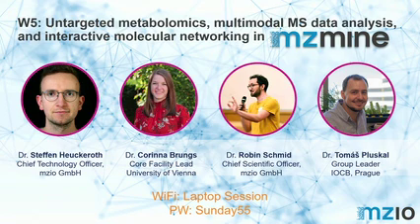So the workshop today will be basically on untargeted metabolomics and data processing in mzmine. We will have a short introduction to what mzmine is about, and then we will go into a hands-on session. The workshop here will be held by me, Robin, and Corinna. My name is Steffen. Robin is the one doing the pantomime here in the front. And Corinna, in the end, will also give you an introduction to library building in mzmine.